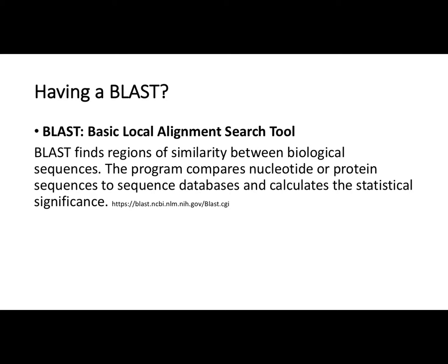Alright, so one of the tools that you're going to be using a lot in this semester is a program called BLAST. The intent of this particular recording is just to get you into the beginnings of how to use this tool. It's a major tool involved in genomics and molecular genetics. It works by finding similarity between sequences, whether they be DNA sequences or protein sequences, and relies heavily on the GenBank database as well as other databases to get information out of.